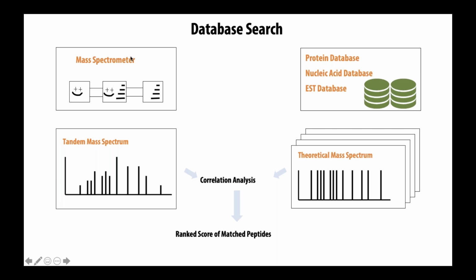But then ultimately, you have your results from your mass spec experiment, but now you have to determine, well, I have all these masses, right? I have this file full of masses, and I need to figure out, what do these masses correspond to? Which peptides do they correspond to? And since you're doing an experiment on a known organism, so let's say you took Toxoplasma and you were doing a proteomics experiment on it. So you purify the parasites, you do the whole experiment, so now you have these masses, and you want to figure out, well, what did it belong to?